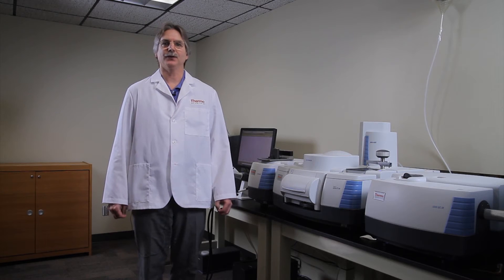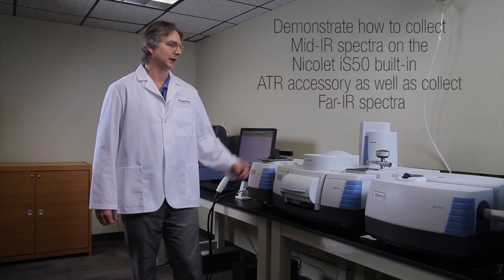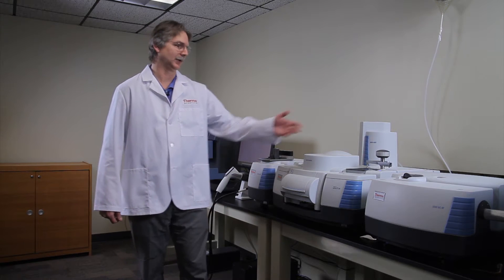Today we'll be looking at some polymer analysis using the spectrometer. Our goals are to collect mid-infrared spectra using the built-in ATR device and also to collect far-infrared spectra using the same device. People who would use this device would be researchers or developers who might want to deconstruct material for their products, or regulatory labs searching for restricted materials like heavy metals in different polymers.